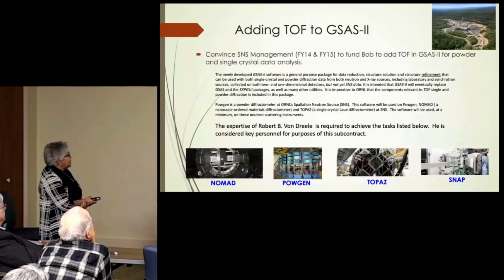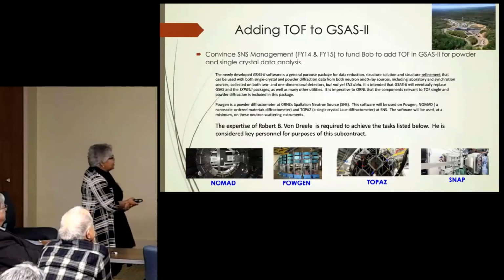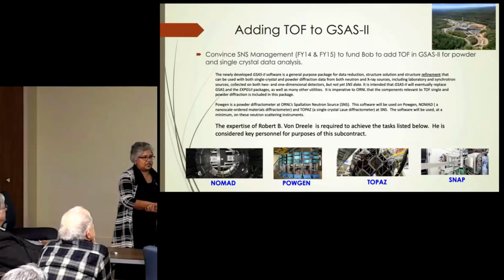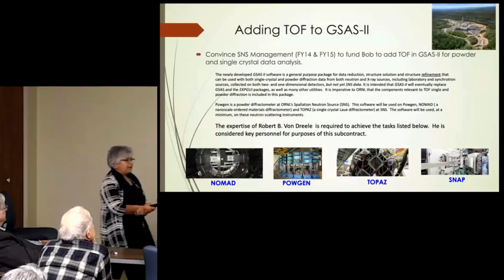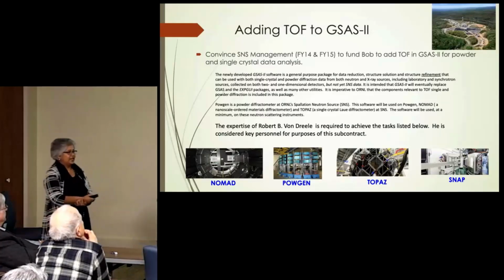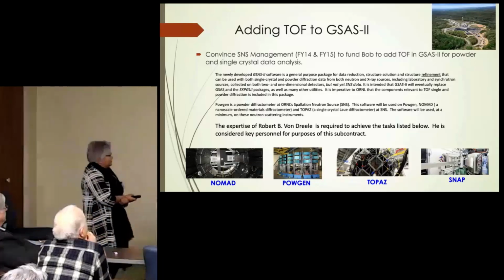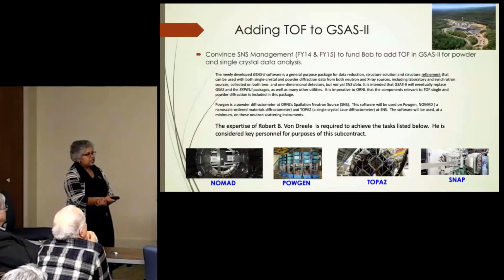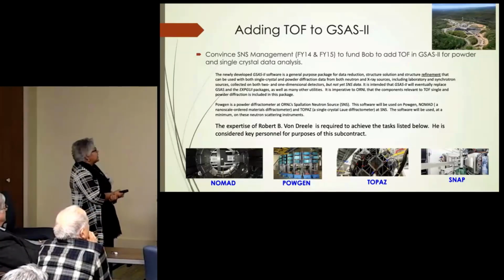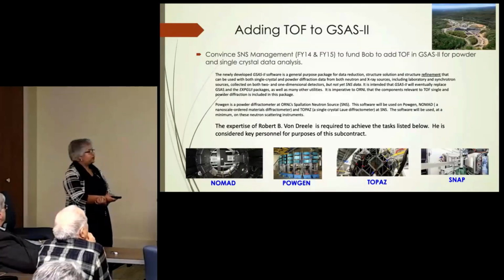Okay, so now I'm at the Spallation Neutron Source. I have all these beautiful diffractometers, which cost, as Ed mentioned, quite a lot more than HIPPO did. But we don't have software support. Hardware was something we knew how to build, and we built these 4 beautiful diffractometers, 2 of them primarily powder, 2 primarily single crystal, and we needed help to do some more software development.